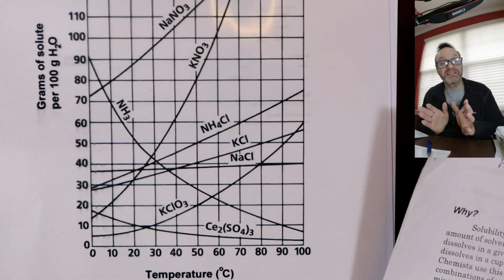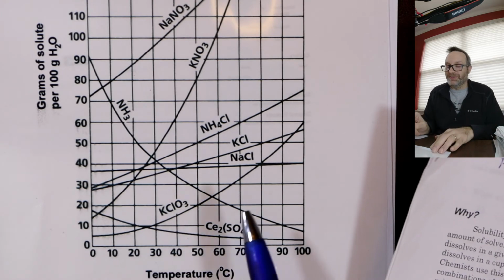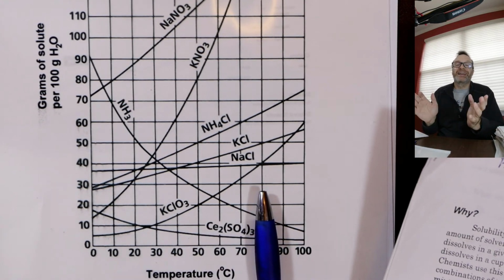Then, let's say once I've made my saturated solution at 80 degrees C, I take it away and just put it in a cooler area, right? What's going to happen? Well, that solution will cool down because you've just taken it off the heat, right? And here's a weird concept, right? The solution kind of goes into panic, right?